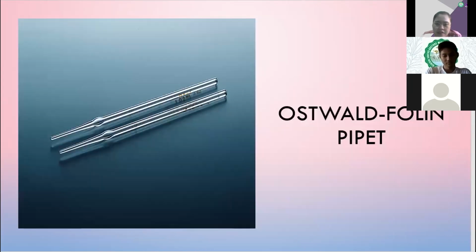And then this one is the so-called Ostwald pipette. It's a small one. And ginagamit ito for viscous fluids. Yung malapot na mga fluids, kung kailangan natin silang i-measure and transfer it from one container to another, it's the time we use the Ostwald.